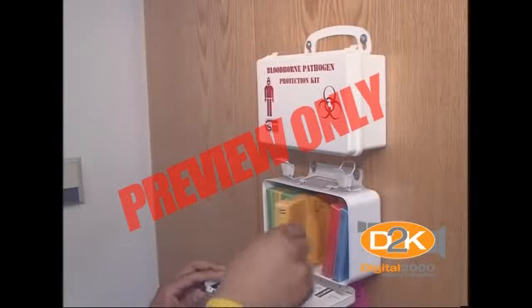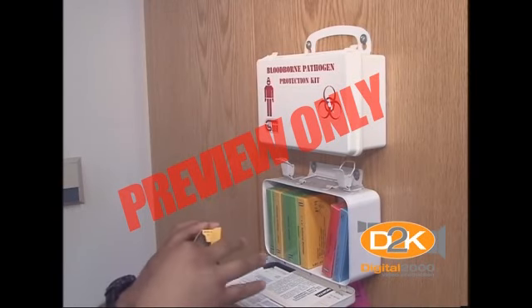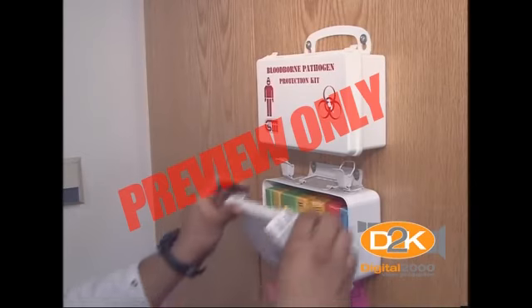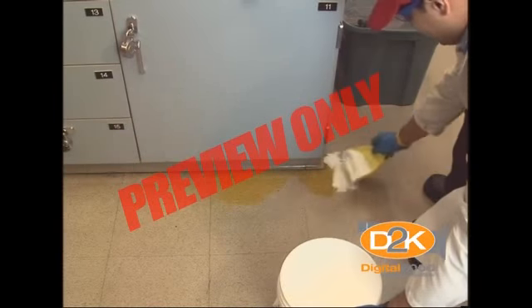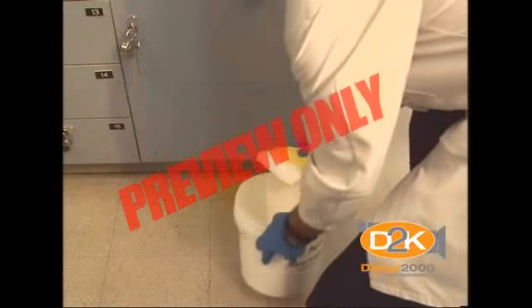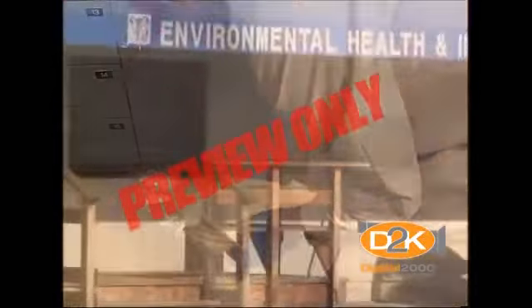All laboratories and laboratory support rooms should be equipped with first aid supplies to assist you in responding to minor injuries and spill supplies relevant to the activities of the laboratory. These supplies should be clearly marked, easily accessible, and located near the laboratory exit. You must know the location of these supplies.